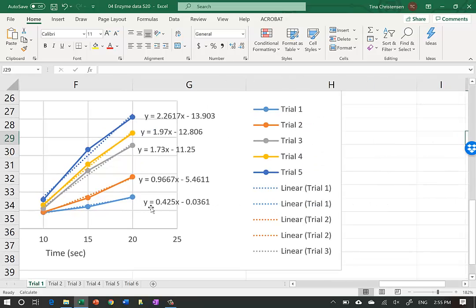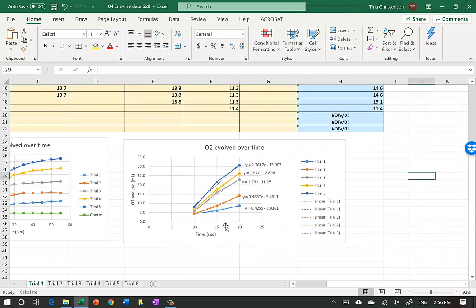The equations are expressed as y = mx + b, where b is the y-intercept and m is the slope. Slope is rise over run, and slope is also rate. You can see that Trial 1 with very little substrate has a lower slope compared to Trial 5 with the highest concentration of substrate - demonstrating increasing rate of reaction. These m values are our slopes, so I'm going to type them into a separate table.